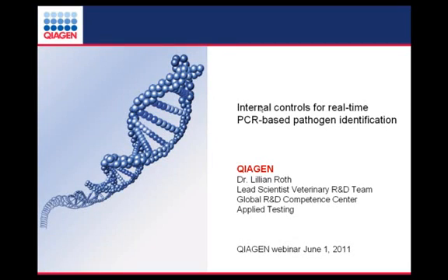Okay, the first question is, what is the nature of the internal control? The internal control templates are naked nucleic acids.